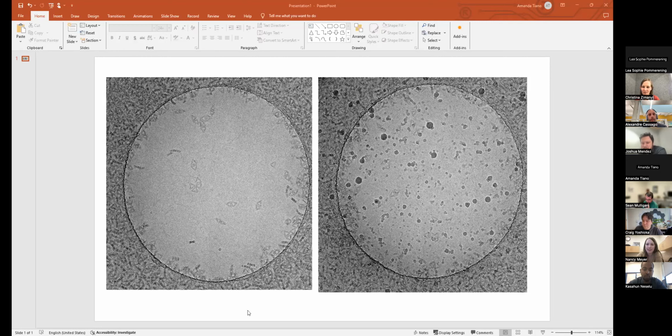And just to take advantage of these images, because we saw some that somebody asked about, where there is no sample inside of the hole. Can you see the amount of protein complex that is on the carbon? So this is an example where we have a protein, and the concentration is very high here. It's good.